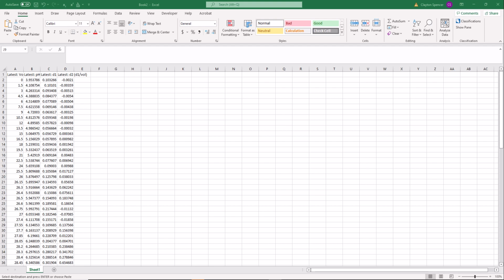This video is about doing the data analysis for experiment number 9, analysis of an acid-base titration curve, the Gran plot. This calculation involves a bit of work, so go ahead and fire up Excel, sit back and get ready to dig in. I assume that you have your data ready, and it should look something like this that you downloaded.